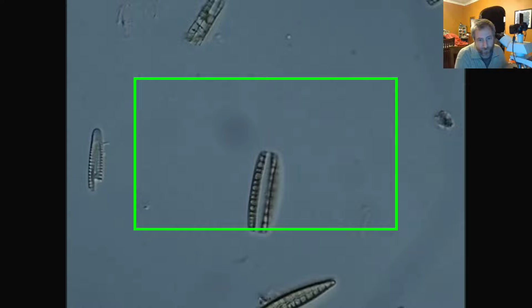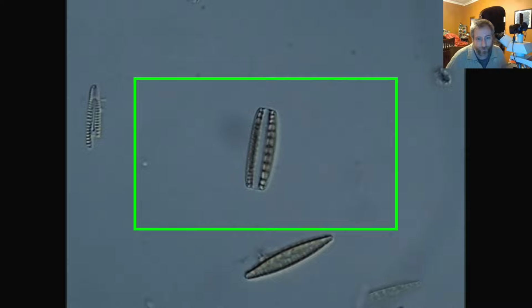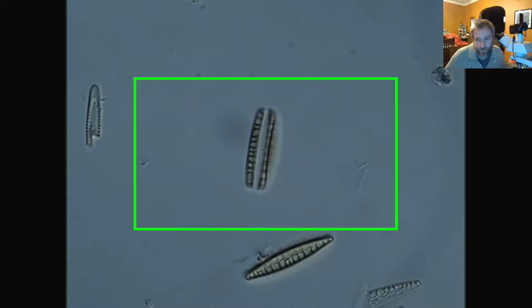So valve view, like a map, we're looking at it from the top, and girdle view, which is the one in the middle of the screen right now inside the box, is actually like looking at it from the side. So you can think of these diatoms kind of like this little slide box, right? If you looked at it from the top, it has a slightly different shape than if you looked at it from the side, so the dimensions might not be perfect from each side. It might be skinnier in one direction and fatter in the other.